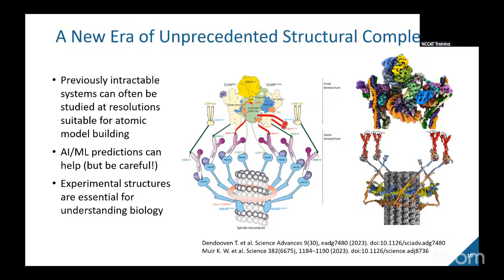But we do have to be careful here. The community should continue to work closely with the worldwide PDB so that when users come to this data, they can really trust that what they're seeing reflects a biological reality. It's not just computational artifact.